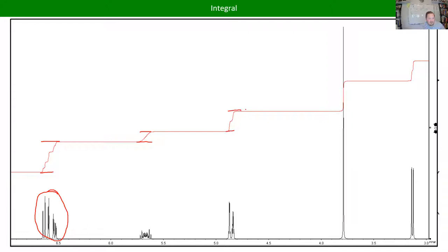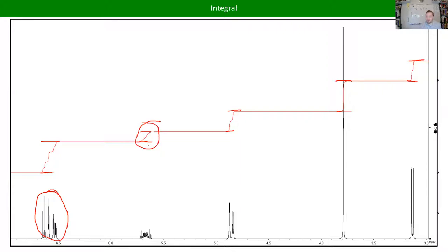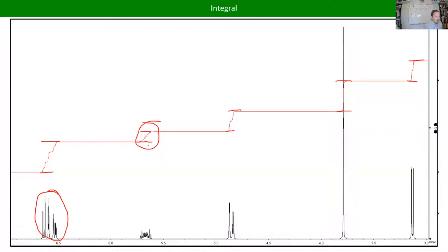When integrating, we just look at where it starts and where it ends, then compare the differences in heights of the integral line to each other. Usually, if you don't have the raw data, you just eyeball it — it should be really close to a whole number ratio. Take a piece of paper, find the smallest peak, hold it up next to the others. If it's a 1 to 2 ratio or a 3 to 3 to 1 ratio, it should be pretty obvious.